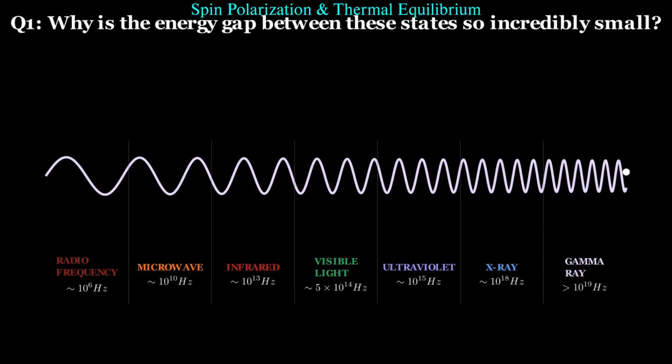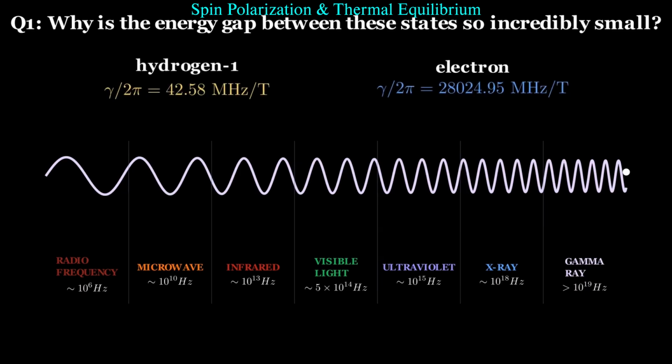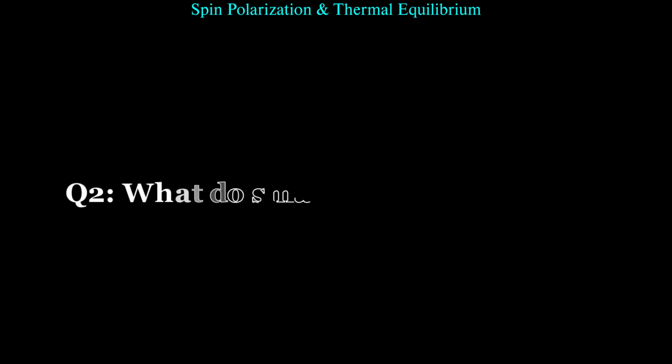And that also explains why the electron version of this experiment, called EPR, uses much higher frequency radiation. Electrons have a much higher gyromagnetic ratio, so in the same magnet, we would fall into the range of microwaves. Radio frequency waves would not be nearly enough to cause an electron transition in NMR, which is good because we don't have to worry about observing electron transitions. But the idea is similar. Magnetic energy levels split inside the magnetic field.